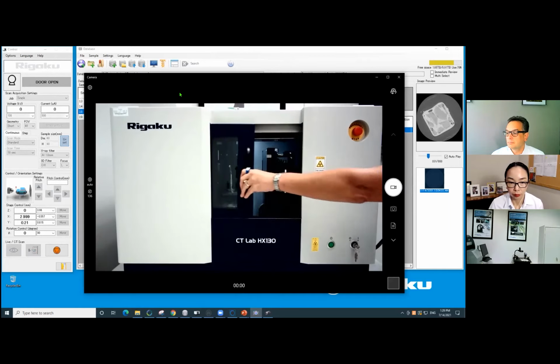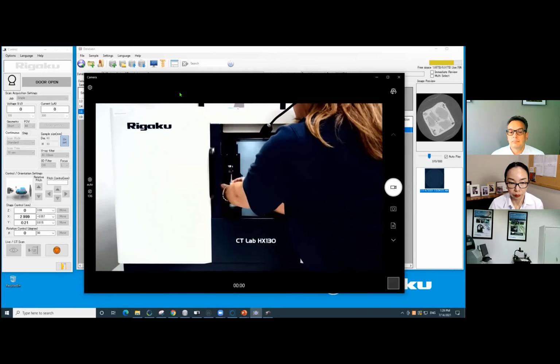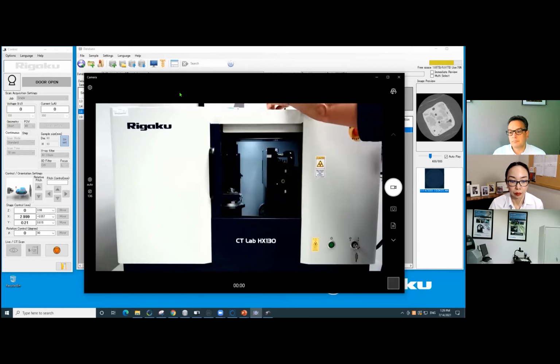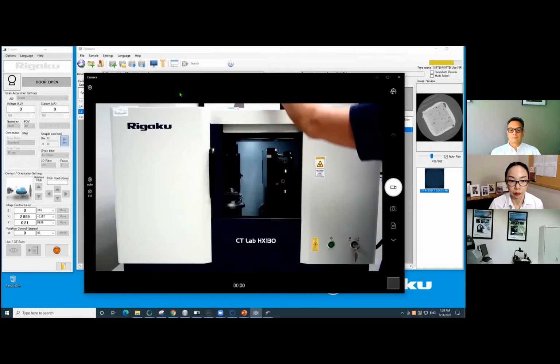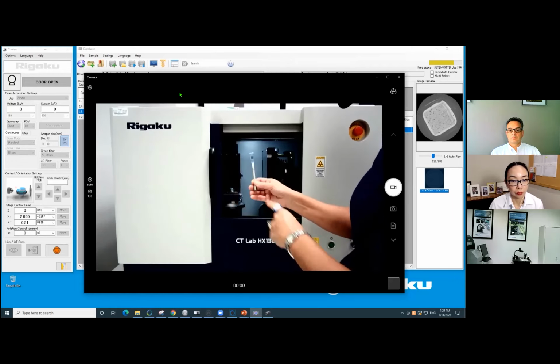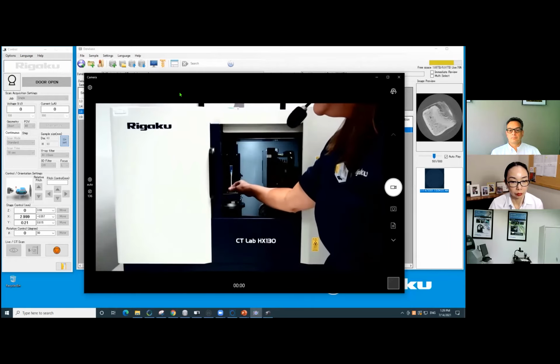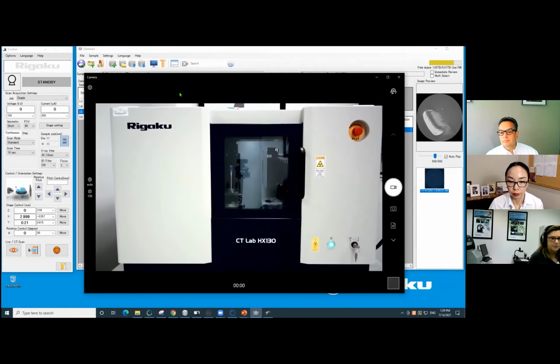So we're going to open up. I'll just take out this sample holder, put it down up here. Oh, and by the way, I just used a piece of screen material, a screen patch, to attach all of those on there. And in this case, I'm just using an Eppendorf tube that's taped onto here and put my pill inside. And tighten. And away we go.